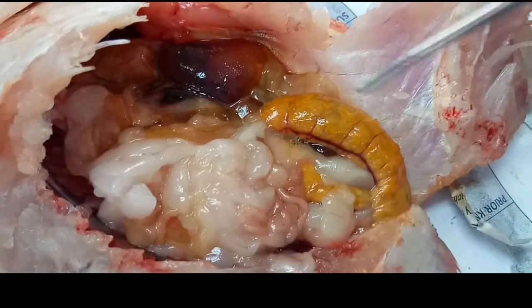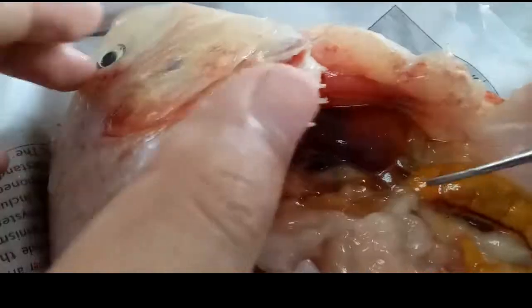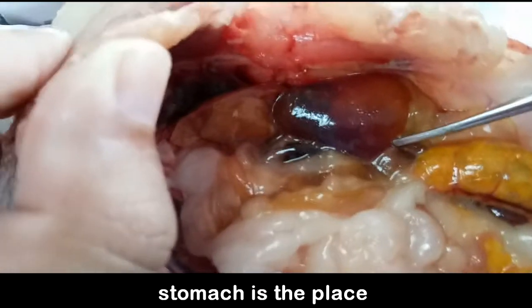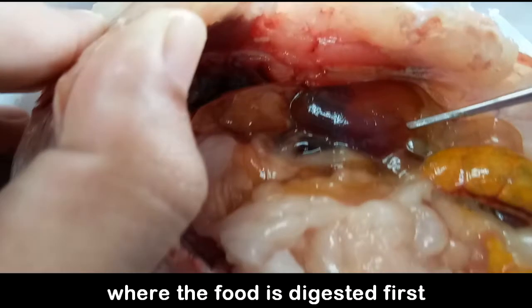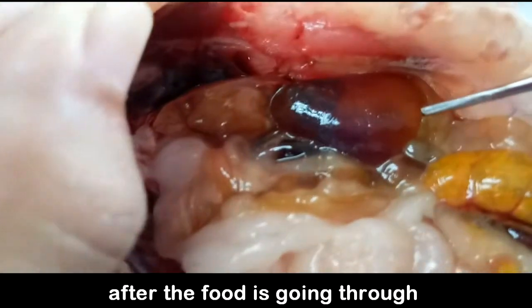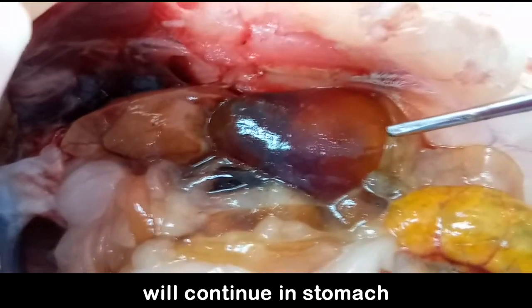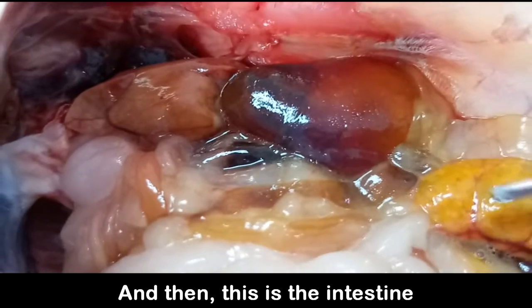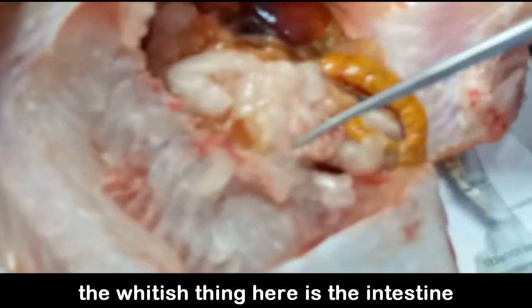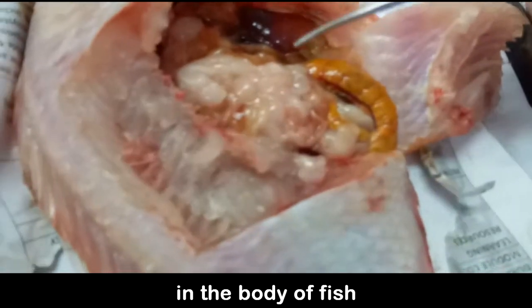And then the stomach. So this is the stomach. The stomach is a place where the food is digested first. After the food goes through the mouth, the process continues in the stomach. Alright. And then this is the intestine. The white thing here is the intestine, for the absorption of nutrients in the body of the fish.